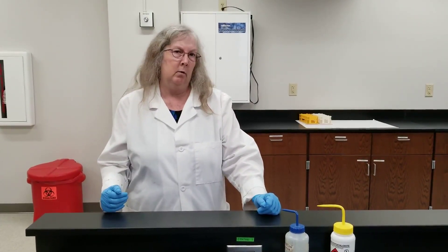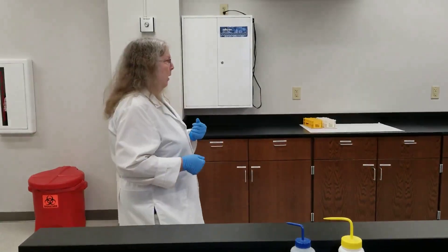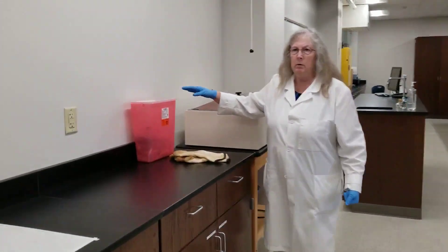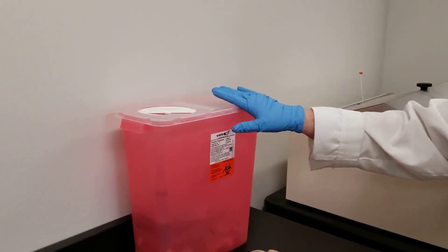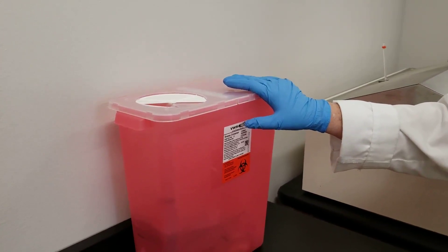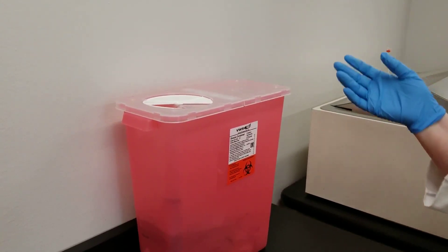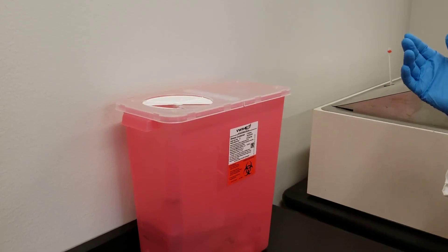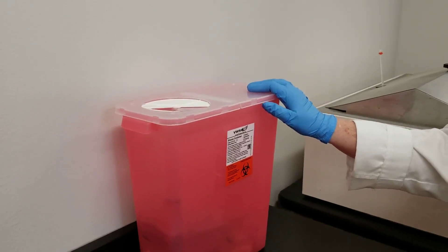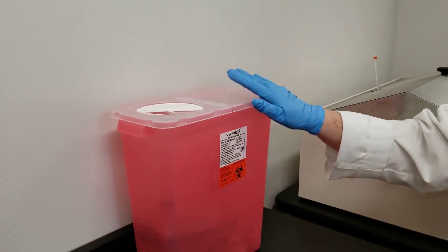If it is contaminated, it cannot go in the regular trash can. We distinguish: is it sharp or is it a non-sharp item? Up front in this lab, we have what we call the sharps container. These are typically always red. This is where you would dispose of any sharp item that is contaminated. Say you were working with bacteria and making slides — you would just drop the slide directly into the hole up front. The slide has bacteria on it, so it's contaminated and sharp. If you were working with needles, it would go in here. Do not put gloves in here. Do not put paper towels in here — they're not contaminated and they're not sharp. Only sharp, contaminated items.